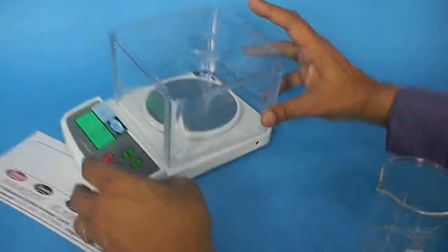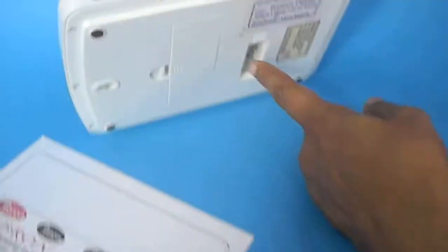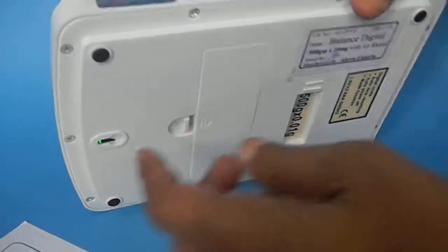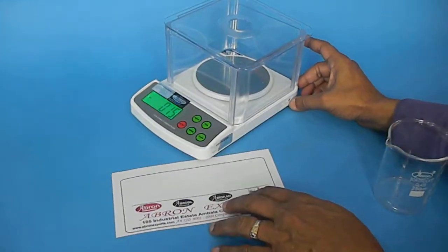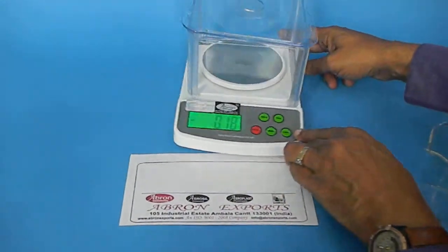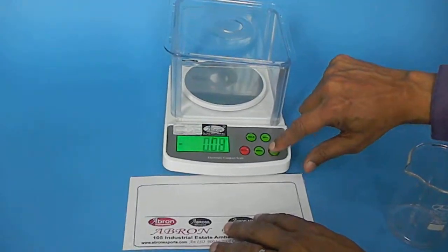The cells are very easy to change on the back. You can use triple A or double A cells. This uses 6 to 12 volt power and is very easy to use.